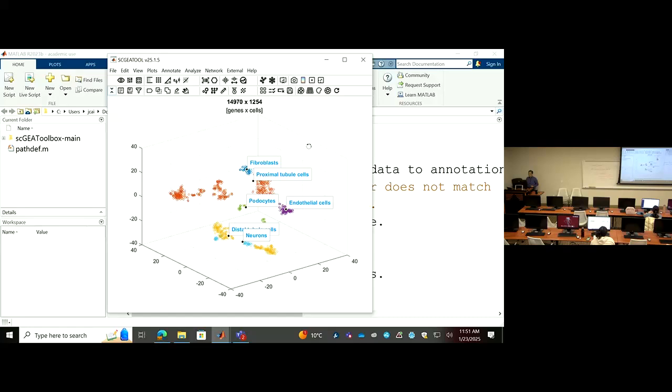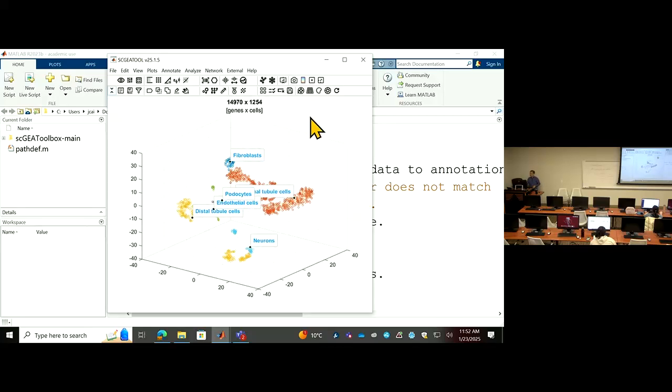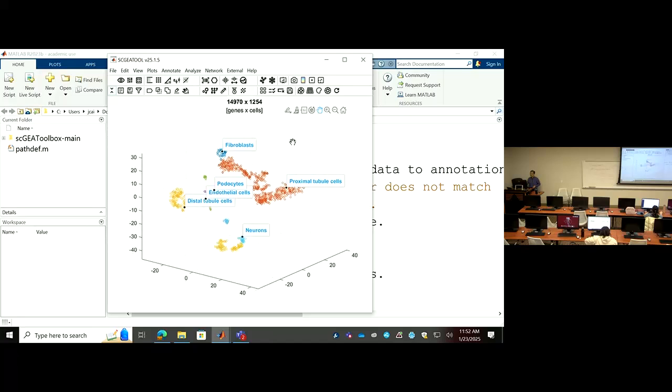Okay, so here, if you look at this hidden button, when you highlight this line, you should see there are buttons you can select to rotate the figure. Okay, and this you can zoom in, zoom out. You can use this palm to drag the position of cells.